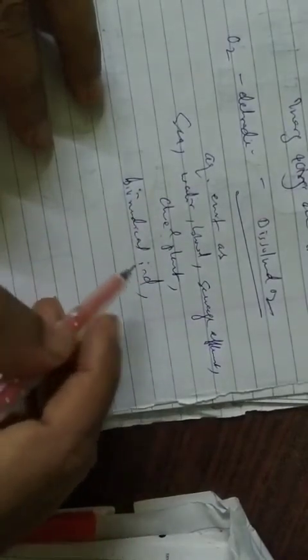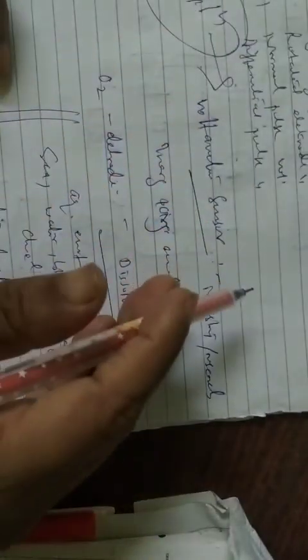Then environmental research and clinical medicine, in all these things we can see there is an application of voltammetry.